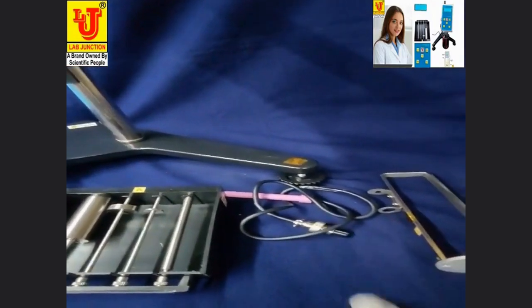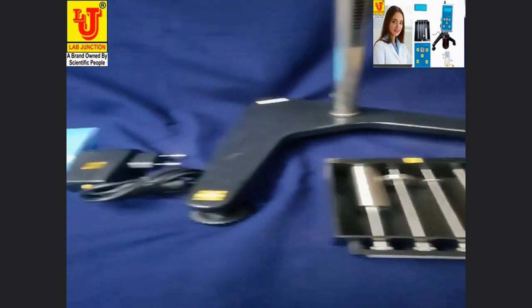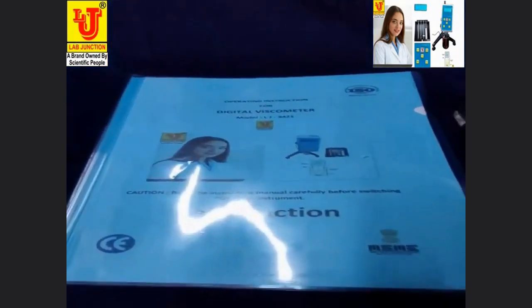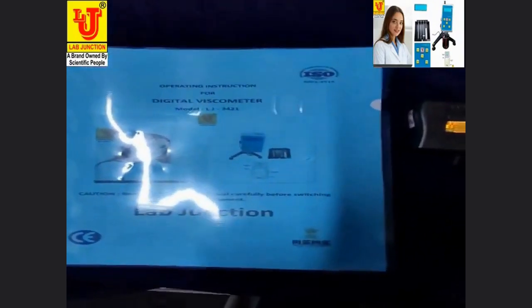These are disc type spindles for low viscosity samples and this cylindrical type is for high viscosity samples. Also included: temperature probe cum sensor, protection frame, adapter for main display, and instruction manual with warranty card.